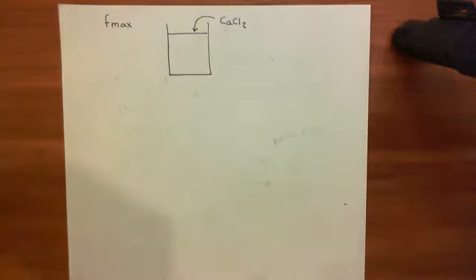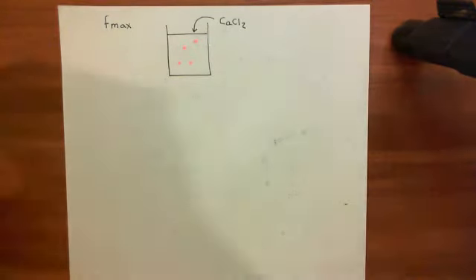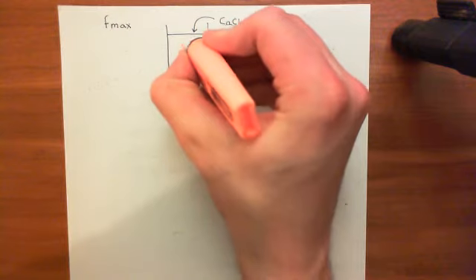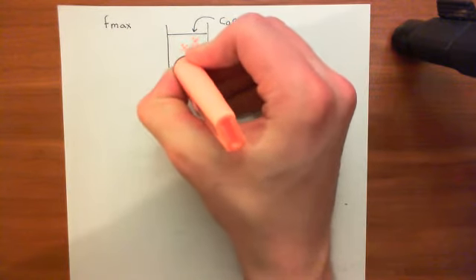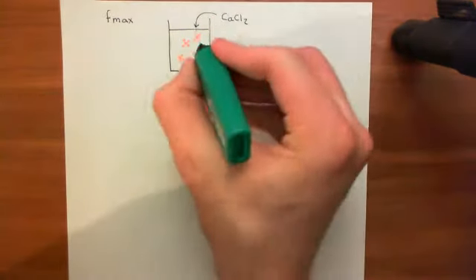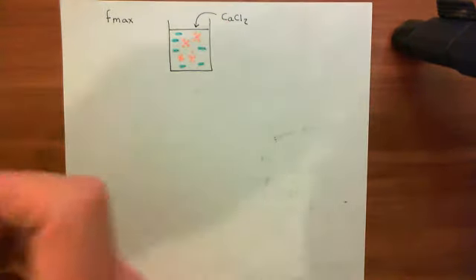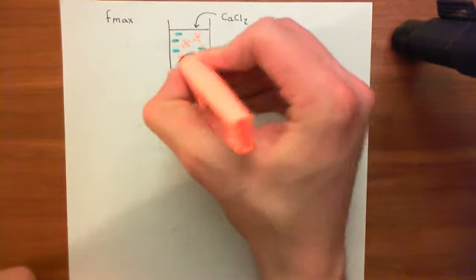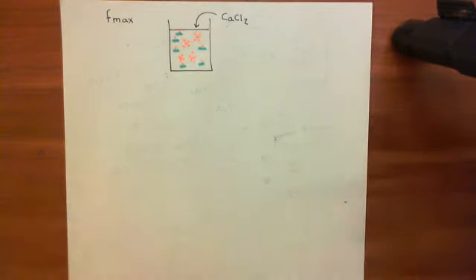So basically, here we have our BAPTA molecules, so I'll put those in. So they're still here, and they're going to get saturated by calcium. So let me show this. So they're all saturated by calcium. Then we're going to put so much calcium in that all the Fluo-4 molecules, and I'll show the Fluo-4 molecules in turquoise here, all the Fluo-4 molecules also get calcium bound to them. Okay, so here's calcium, here's calcium, here's calcium, here's calcium, here's calcium, and here's calcium. Okay, right.